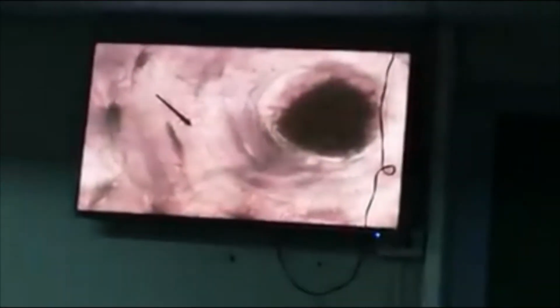Those are the projections in between the osteocytes. Now, what is the function of your canaliculi? Can you see them? These are all your bone canals, found in between your osteocytes.